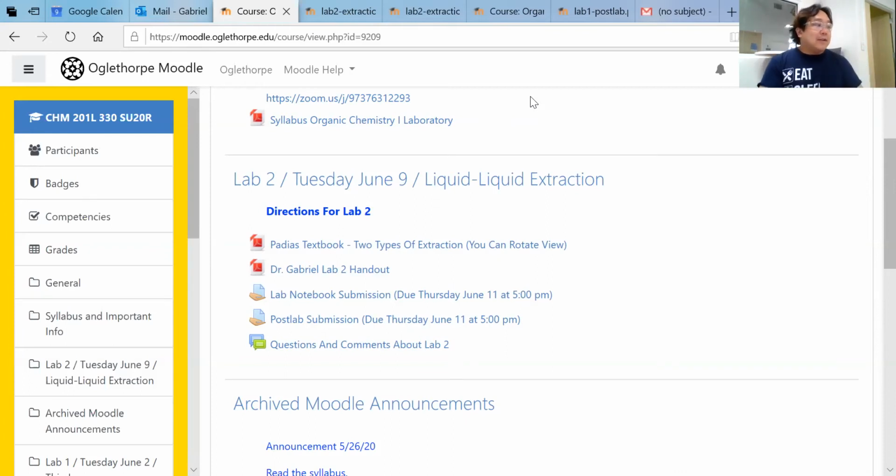Okay, and then obviously, if something changes, like if we do a reaction and that clear colorless liquid becomes more viscous, and you could tell that by the stir bar having a little bit of resistance, or did it change color? Did it produce some fog or some smoke? Did it bubble a lot, or did it just foam up? All of those observations are going to help you get a good grade on your lab notebook. Enough about that. I actually don't know how long I've been talking.